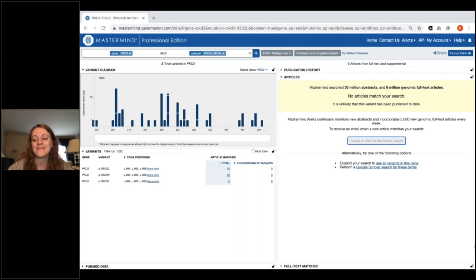Great. Thank you, Rachel. Rachel brought up the 3 benefits when you encounter this situation, which happens in particular when you're doing exome sequencing or working in rare disease. A null result here is a victory for Mastermind users because we refer to this as the power of 0.